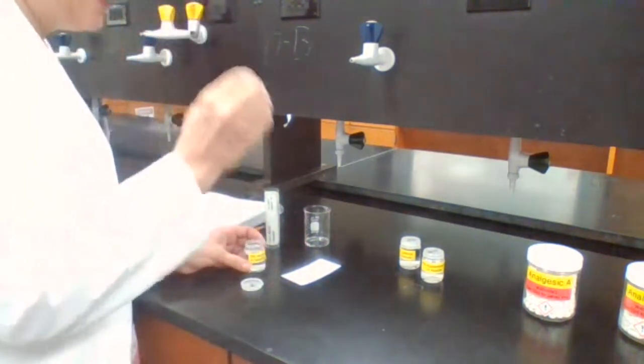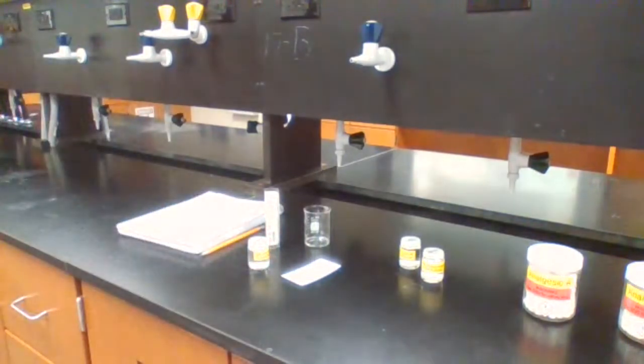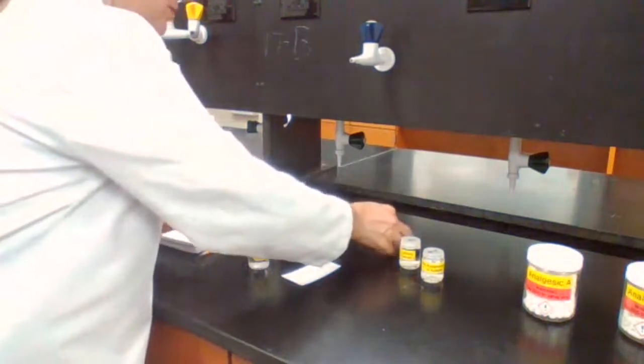I cannot use this capillary tube anymore because I cannot mix it with any other solution.